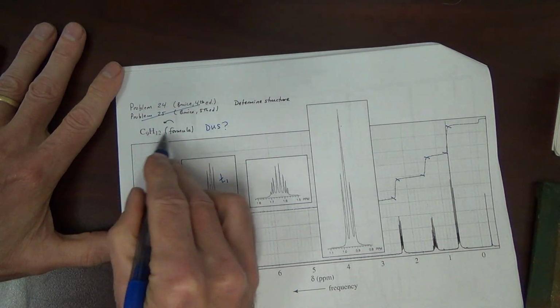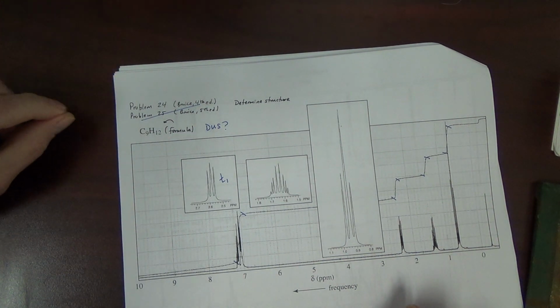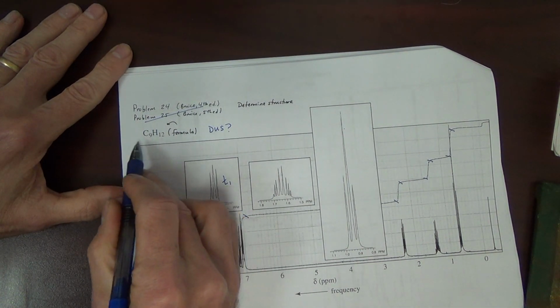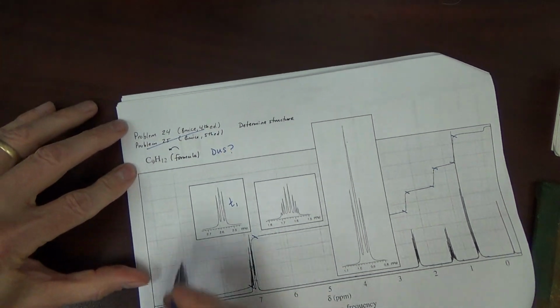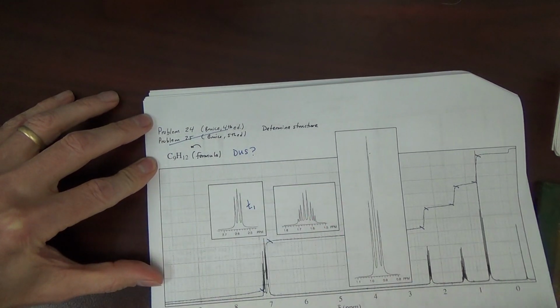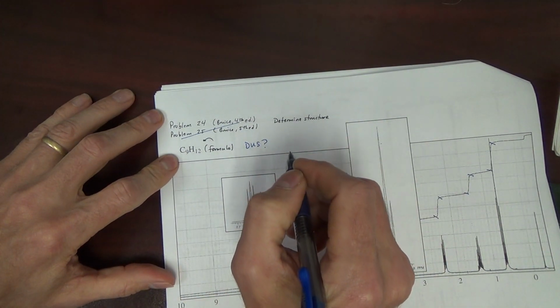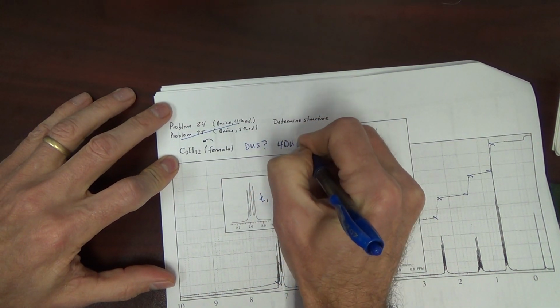Okay, formula is given here. In some cases down the road, you will not have formula. But formula is given here. And there's information that can be taken from the formula. For example, degrees of unsaturation. How many DOS are in this formula? C9, that would be 2N plus 2, 20. We're missing 8 hydrogens. Divide that by 2, 4. 4 DUs.